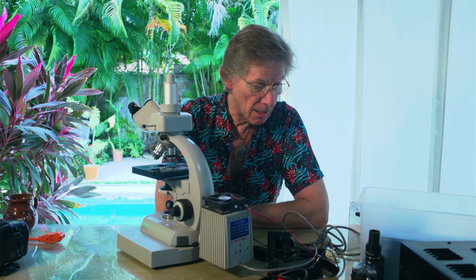So once again, Zeiss is, and there's an expression, Zeiss price, because they are extremely expensive microscopes and worth every penny that is spent on the high resolution that they are capable of. However, Nikon is another company that makes microscopes that are equally as high quality with equal resolution, and we are currently filming this educational piece on a Nikon camera.